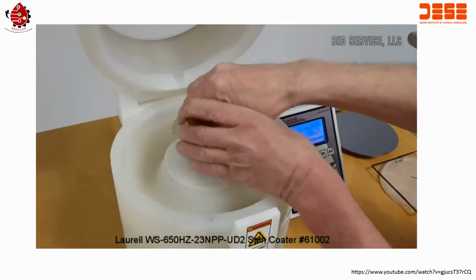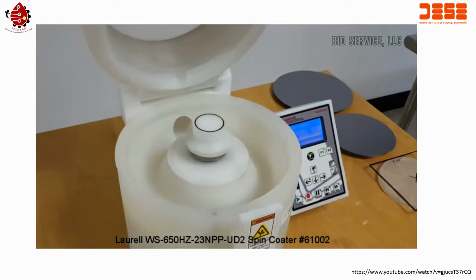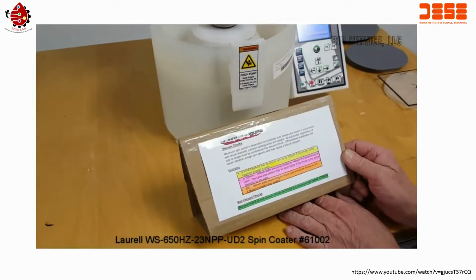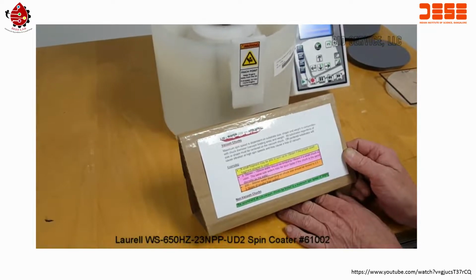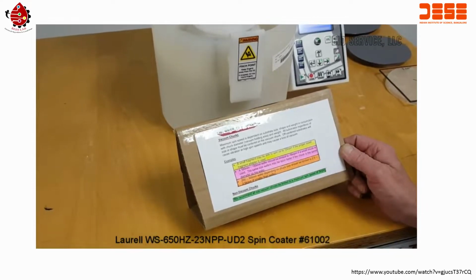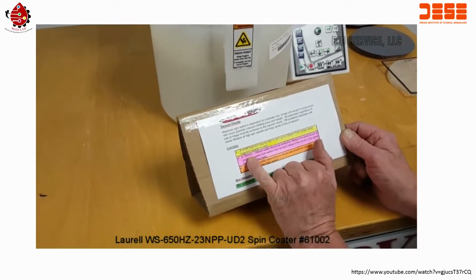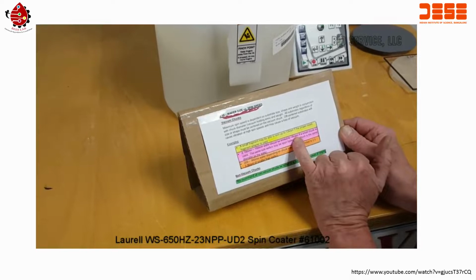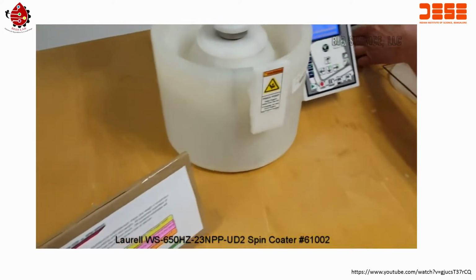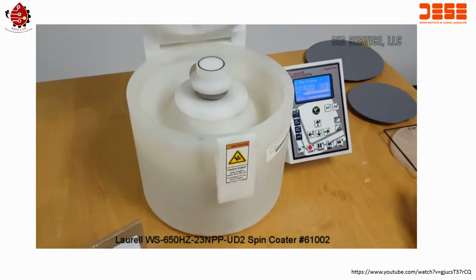Now next, I have this chart here, and this is wafer size versus spin speed. Obviously, the smaller the workpiece, the faster you can spin, and they've given a little guideline here. First, we ran this little guy up to 12,000. Now we're going to run a 100 millimeter wafer, as suggested, up to 6,000. This is actually 150. We use a little 100 here.